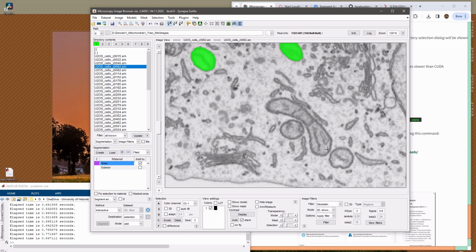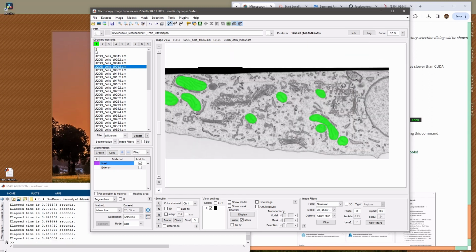So you can see it's actually very easy. You can just shift click to here, control click to here, next one and next one without the ER profile. Yeah, you see it's very quick, and then you can quite easily get a segmentation of especially blobby objects. Things like ER are a bit more tricky. I won't talk about this now.